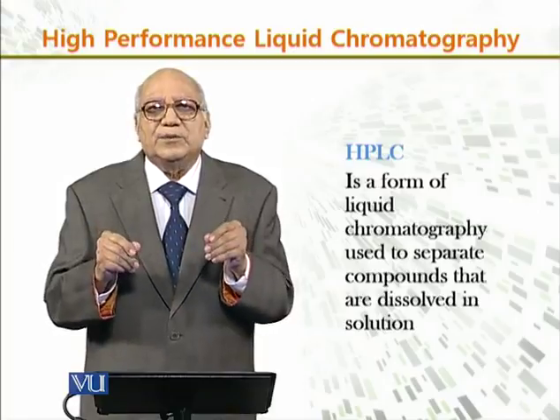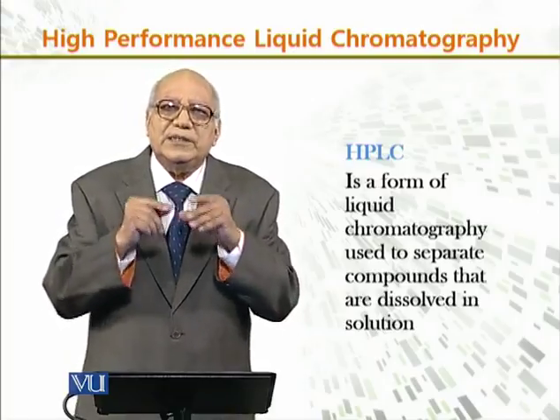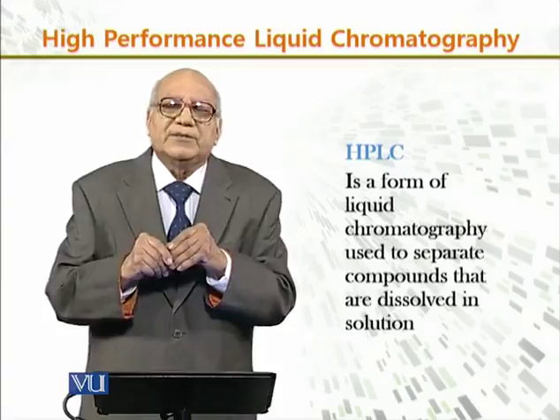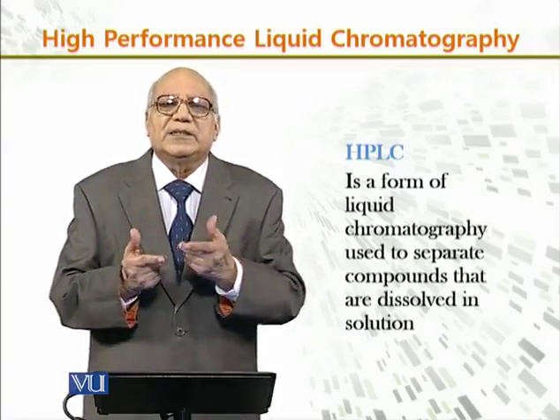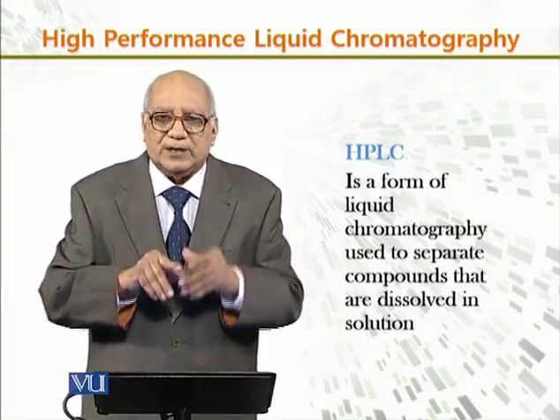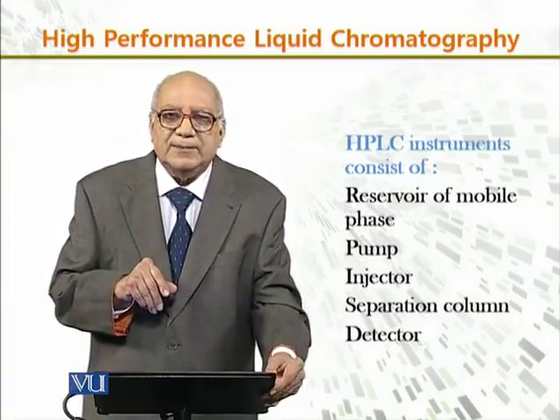Thus, mind you, this technique is used only for those samples which are soluble in solution of some sort or another.